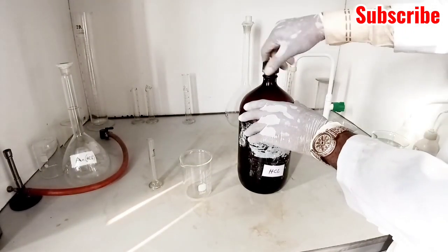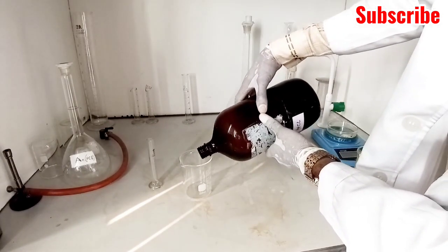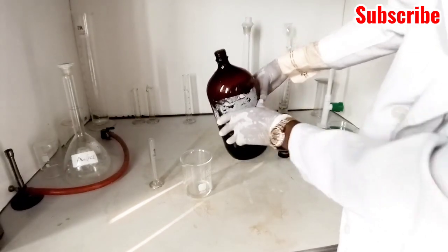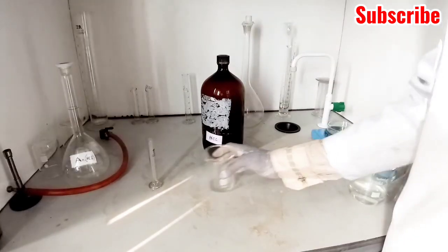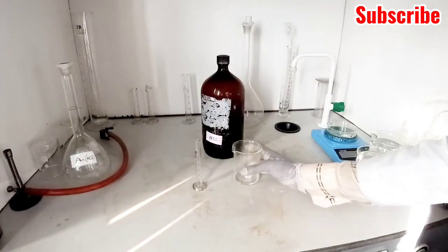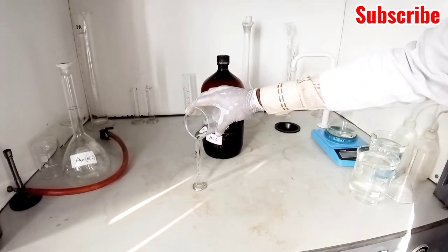Alright, here is our HCl, our stock solution. So we pour out a little quantity from it. It has a 12 molar concentration. Then here is a measuring cylinder, 10 ml capacity. We'll measure 8.5 cm cube accurately from it.